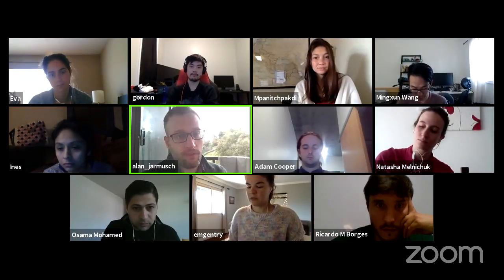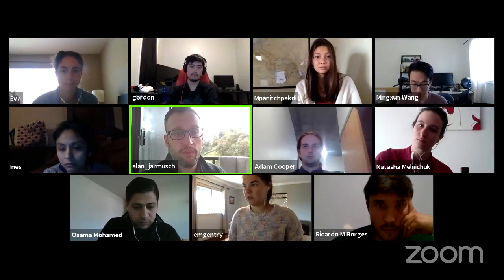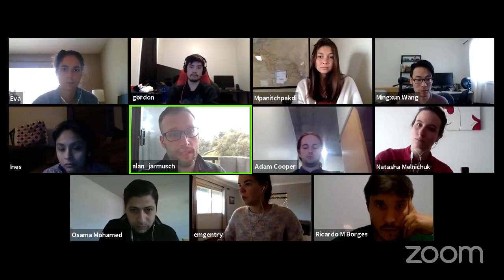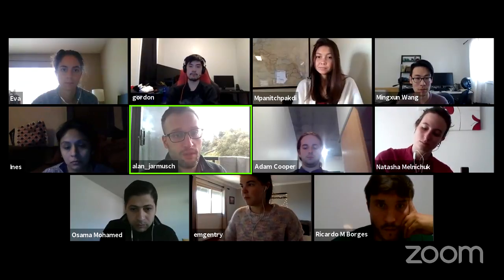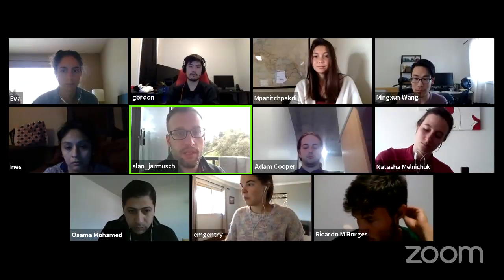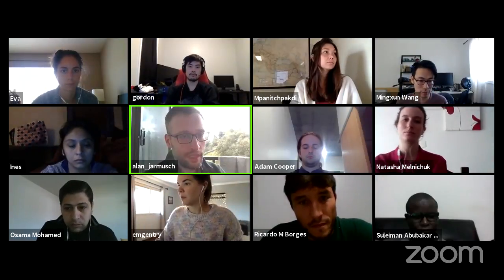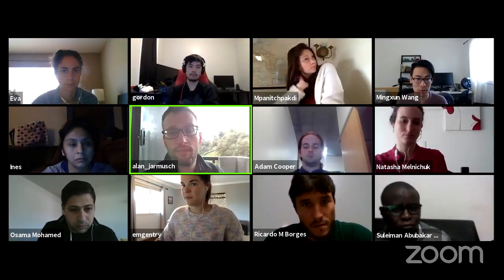So I recently did it as an SI. I just provided all those links alongside the annotations that I made. That way anyone could go back and look at the same spectra and interpret them the way that I did. So it's a really nice additional piece of information to add with your publications that further adds to this ability to reanalyze, reprocess, and share the same data that everyone's looking at.